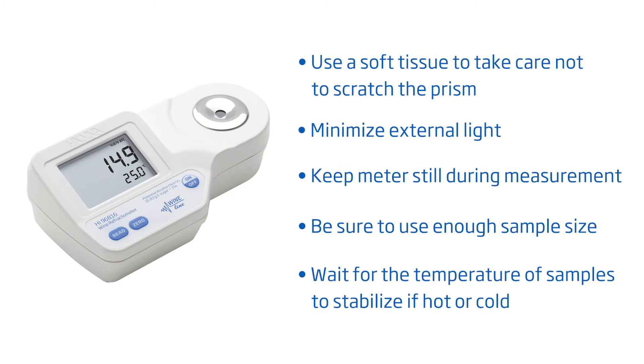To get you started right away, here are some tips to follow for best results: take care not to scratch the prism, minimize external light, don't move the meter during measurement, make sure to have a sufficient sample size and no bubbles on the prism, and wait for the temperature to stabilize if your sample is hot or cold.